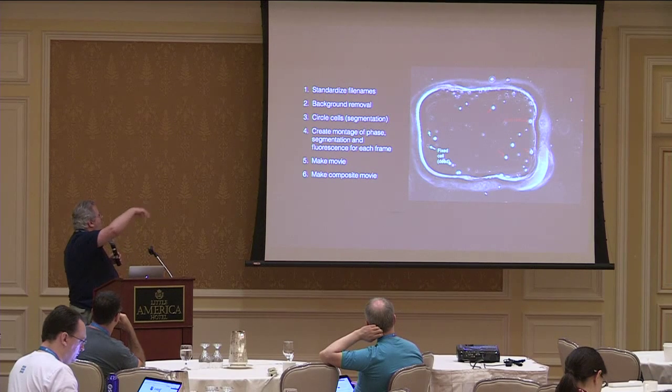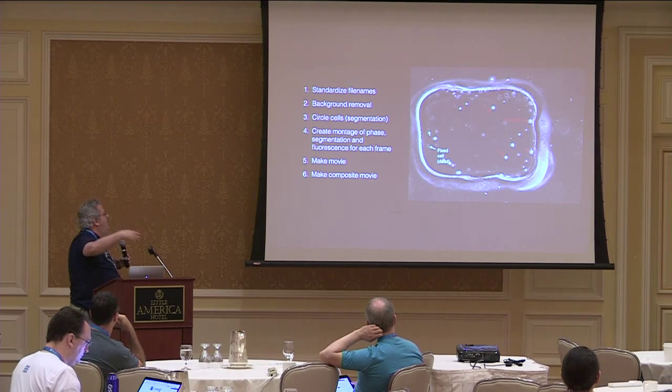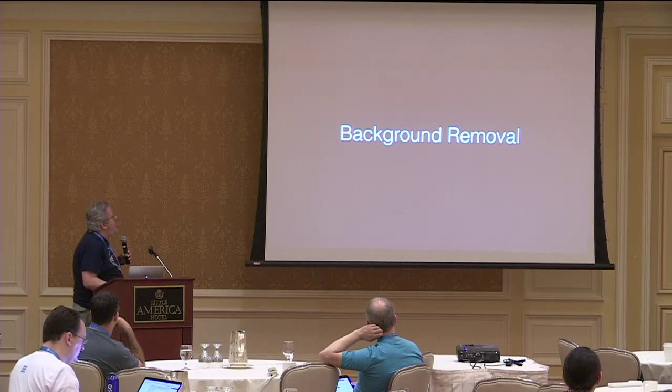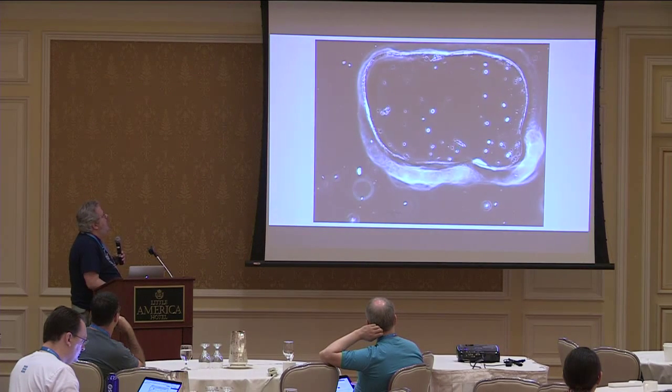So then we're going to remove the background from these wells and then try to do the segmentation and make some montages and some movies after that. So, background removal. So here's that 100-frame movie again.